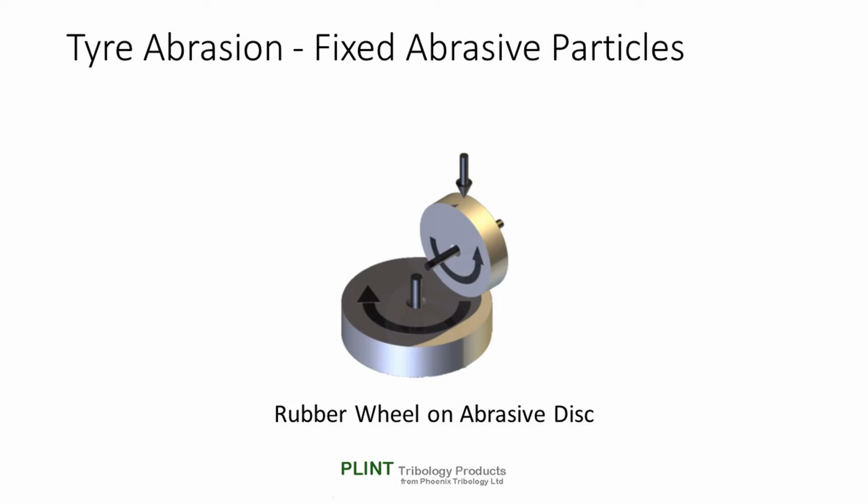switched round. Tests on candidate samples are used to determine comparative wear rates, and as stated, the method is recommended for abrasion tests for various rubber products, especially tyres.